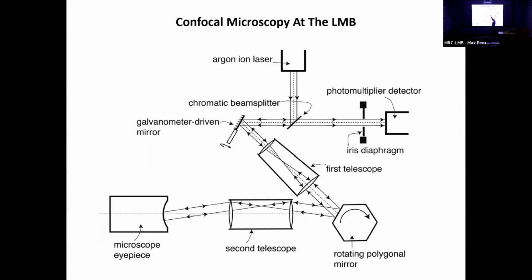They got a beam of light, a collimated beam of light, through sort of an X mirror. Well, this is a Y mirror, the slow scan direction, imaged onto another mirror that scans in the X direction. It goes through the telescope into the microscope and thence to the sample down here. The fluorescence comes back through this whole mechanism.